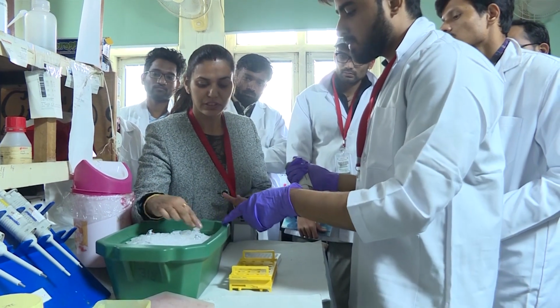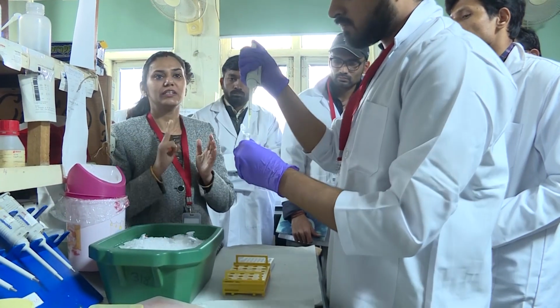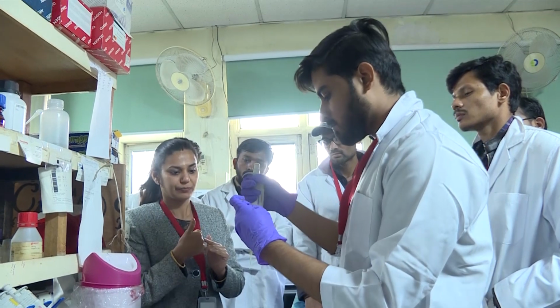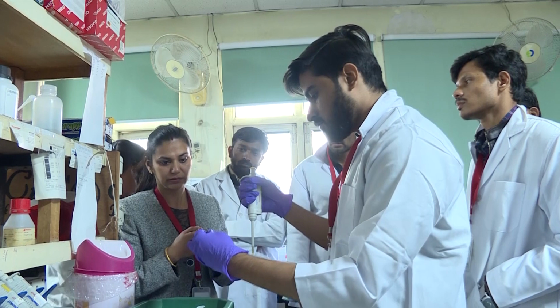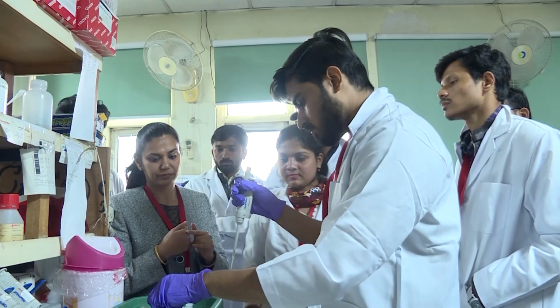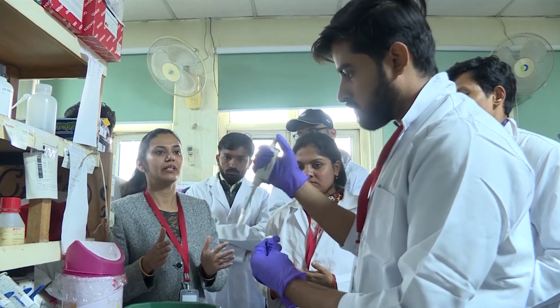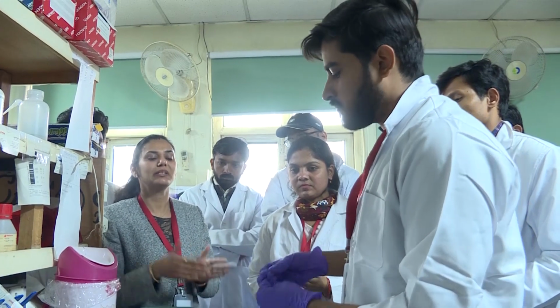Have you added water? First add water. Only the SYBR and the water are common in all the reactions, so we make one common mix of these. When we are working on RNA or RNA related work, we have to be very careful, because RNA is very sensitive. cDNA is stable compared to RNA, but still we have to take care.